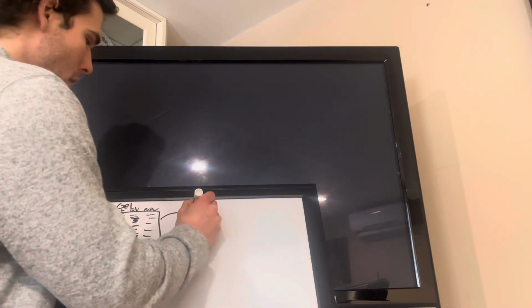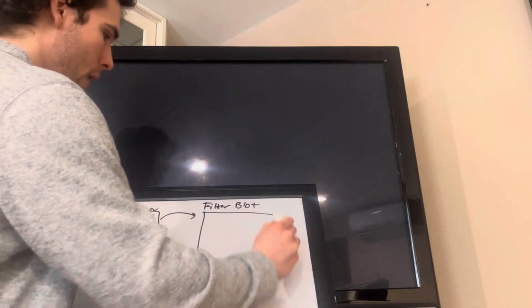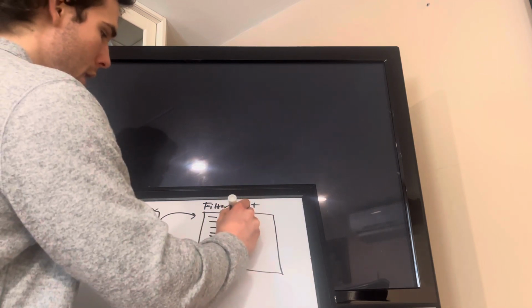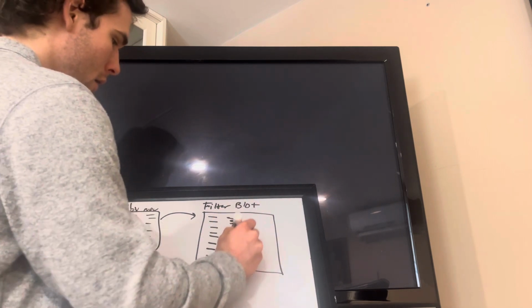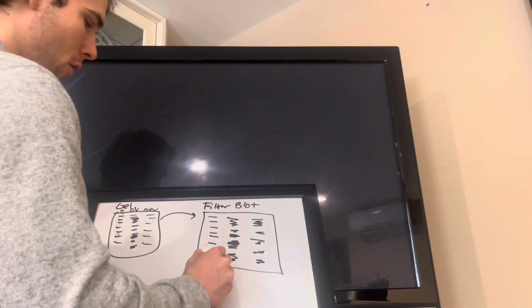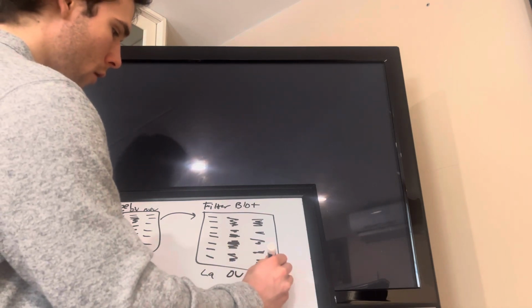And to run a blot, this would be transferred over to a filter paper. So the actual blot would look like this. You'd have the ladder, which is this first one. And then you'd have the cells that were treated with the overexpression vector for P53, and then the cells that weren't treated with the overexpression vector. Usually these letters would be up top, but there's just that writing right there. So you'd have the ladder, then the overexpression vector, and then the non-overexpression vector.